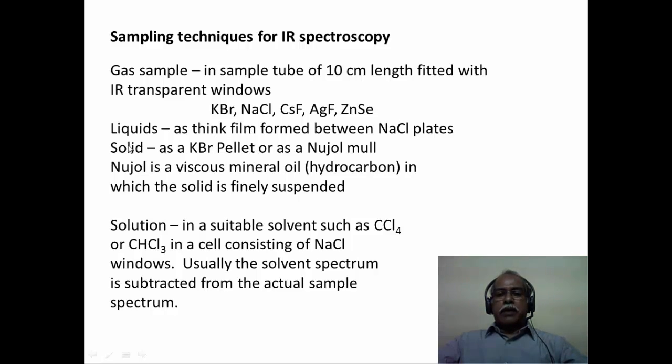Or the solid can be dispersed in a hydrocarbon medium, which is known as Nujol. Nujol is a very viscous mineral oil consisting of saturated hydrocarbons. A fine suspension of the solid in the hydrocarbon mineral oil is what is known as a Nujol mull, and that can be used for measuring solid state materials.